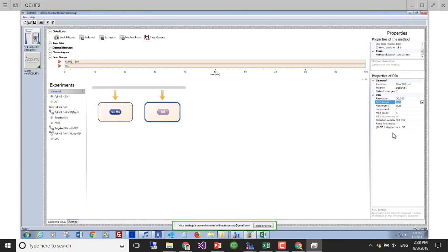If you don't have to fill for quite so much time, then the overall time is going to be diminished. But one of the things that we really benefit from with DIA is that we like to have our scans regularly ordered so that it's much easier to do the mathematics to interpret the data afterwards. So if the timing between each scan cycle is the same, then we don't get weird compression effects at the beginning or the end of the gradient. I don't know if that makes sense, but we benefit from wanting to keep the scan time consistent from one cycle to the next.